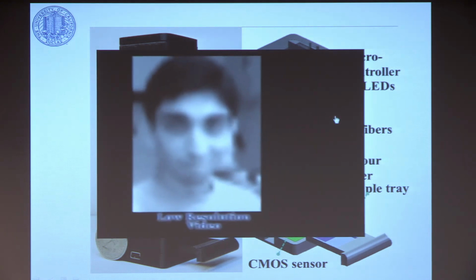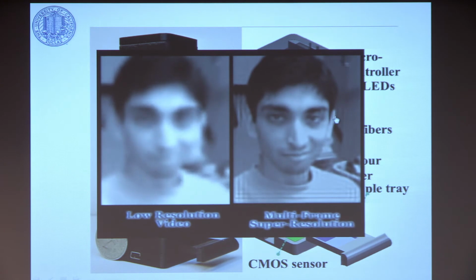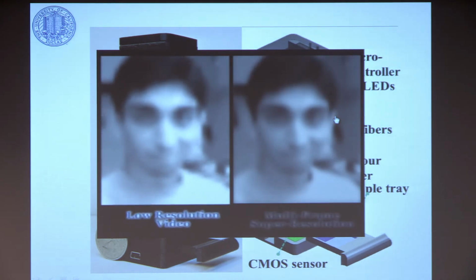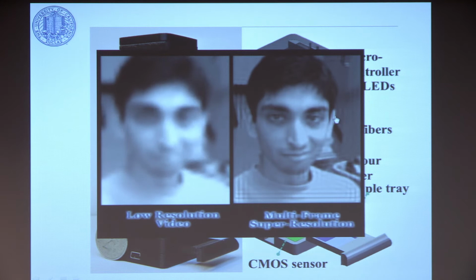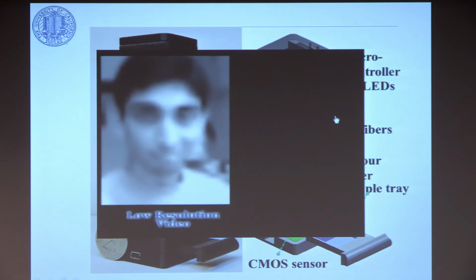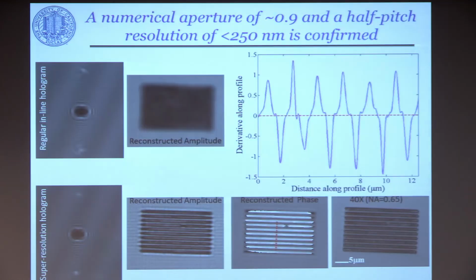It gives us the framework to synthesize higher resolution images using a mathematical theory called pixel super resolution. Another way of saying it is we capture slightly jittered images and put them together exactly like what you see in this movie to synthesize a higher resolution image. Some security cameras use this kind of technology to reveal your car plate numbers if you're moving fast with respect to the camera system.